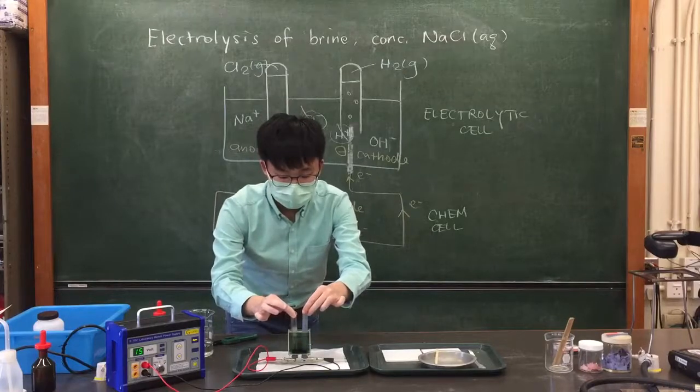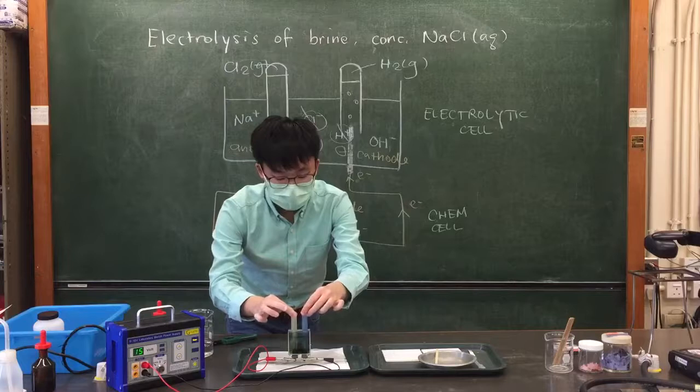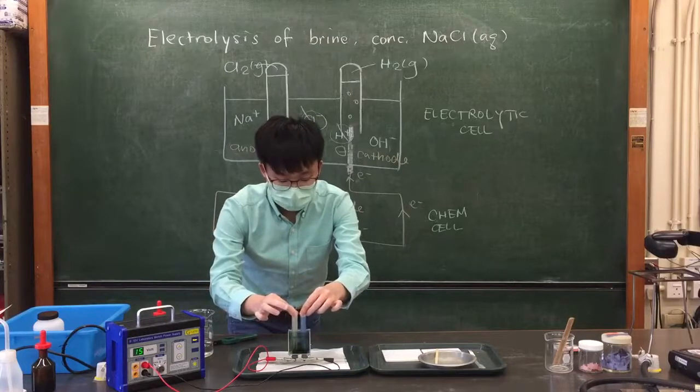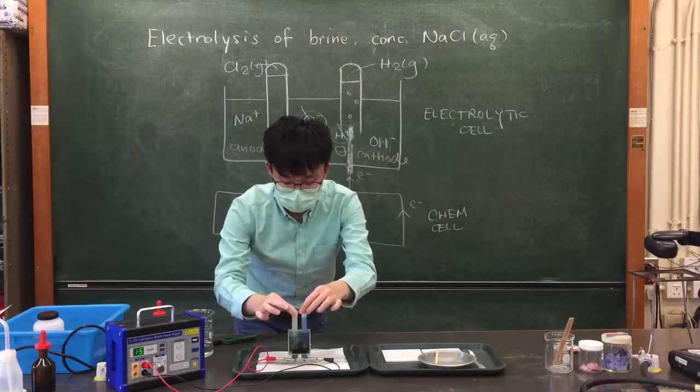Wow, it's so fast. And observe the color change as well. On the right-hand side, it is very bluish, and on the left-hand side, it's very yellowish. And look at the rainbow color down below. Okay, let's check.